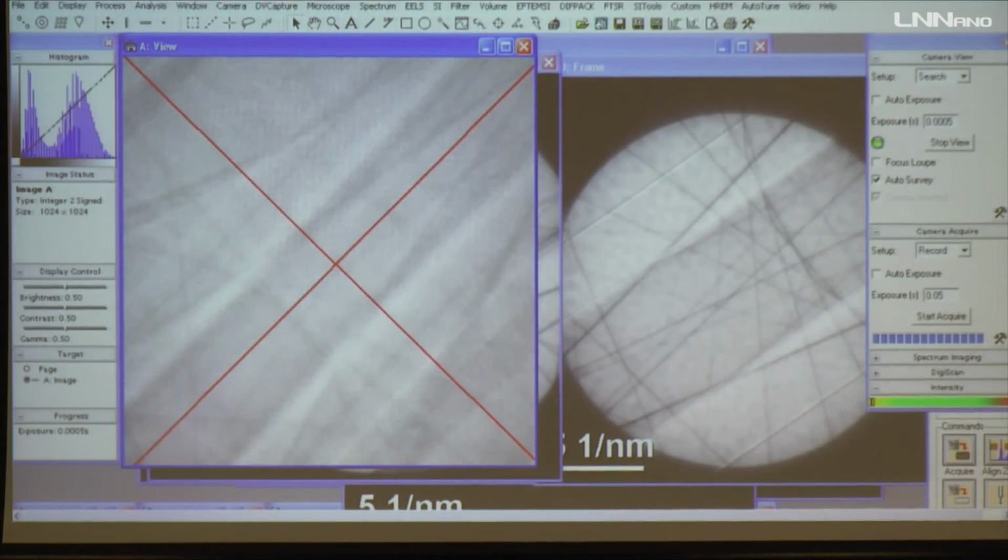If you want to understand the thickness, the best way is the CBED technique. I need to warn you, this is for measuring a thickness of greater than 40 or 50 nanometers or something like that. If you're going to measure lower than that, you can use the EELS technique. So for the lower range, use EELS. For the higher range, use CBED. So that's the thing, but don't use the contamination method.